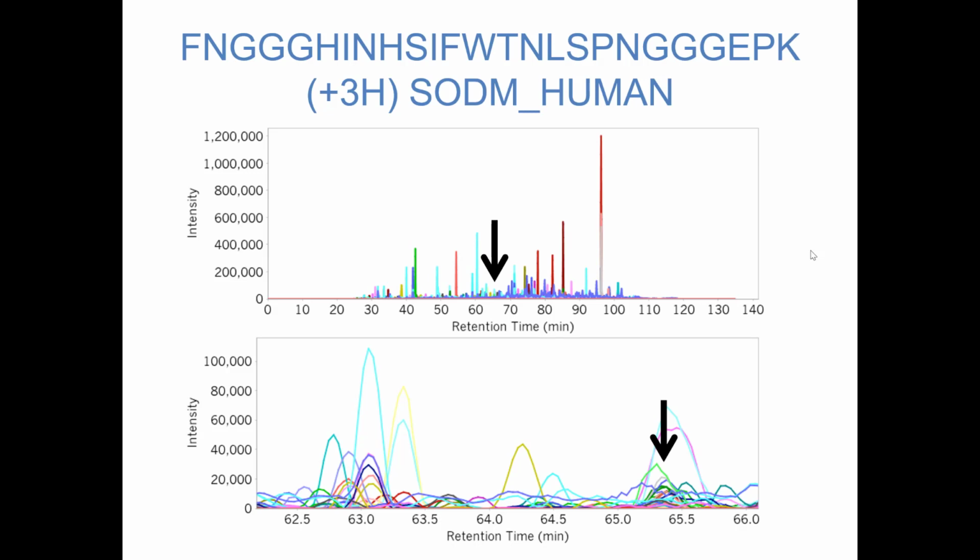And the question is, how did I know that? That's pretty hard to make that call from this level of data. But I promise you it is. The way we know is because we have prior evidence. Because people have been analyzing HeLa for generations at this point. Maybe not with mass specs, but now we have a huge wealth of data about HeLa, even in most people's labs, actually. And so we know sort of how peptides behave in the mass spectrometer.